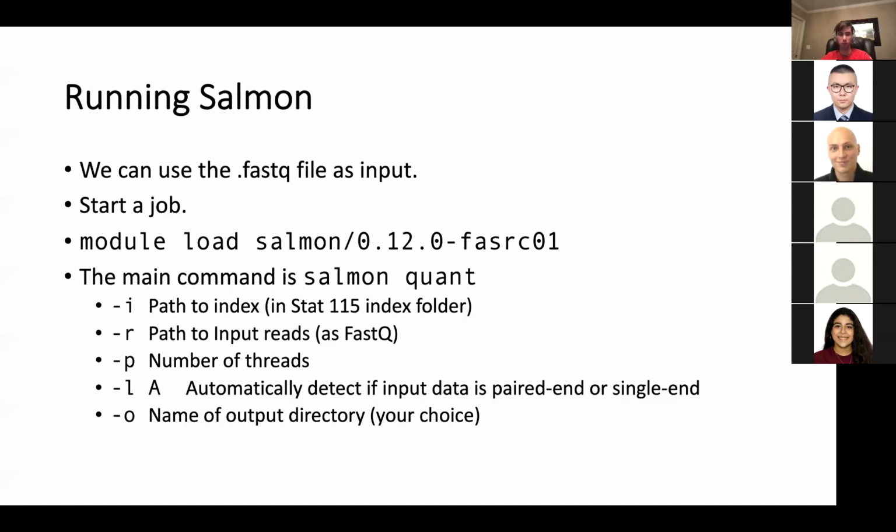No, it'd be salmon quant space -i, whatever, space -r. Don't put any new lines in. Sorry if that's confusing. It's just like you would for STAR, where you put spaces between the different options, no new lines.